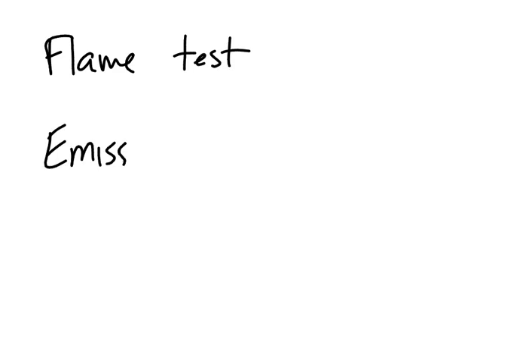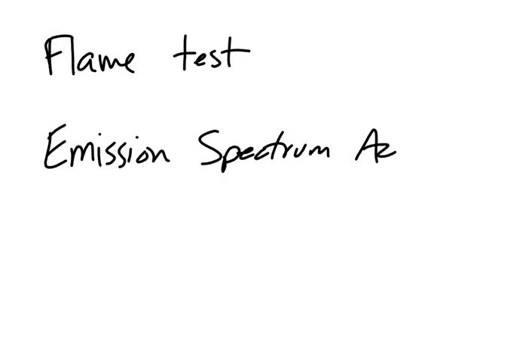All right, this is a light pre-lab video for you guys. We have two different types of experiments, and not really experiments, but two different types of activities that we're going to be doing today. One of them is not with that, but with this, a flame test, and the other one is going to be an emission spectrum, not really a test, but more of an activity, like I said.